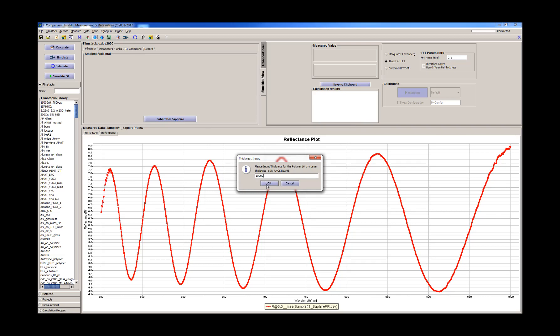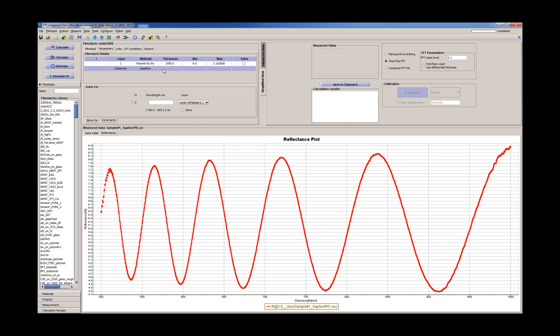The thickness here is in angstroms, so we have 1000 nanometers. We know that it should be approximately about 1.5 microns, the thickness for the resist.